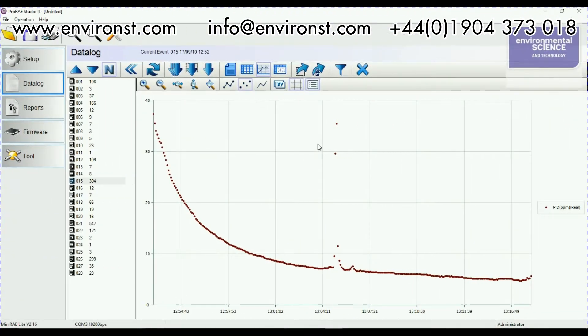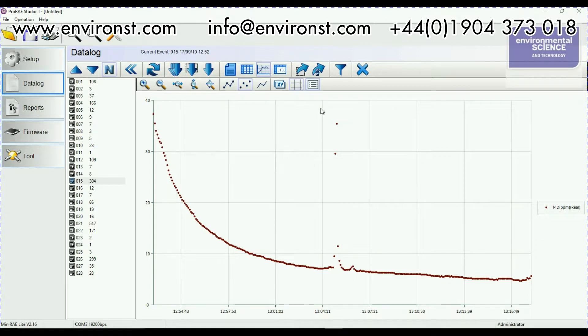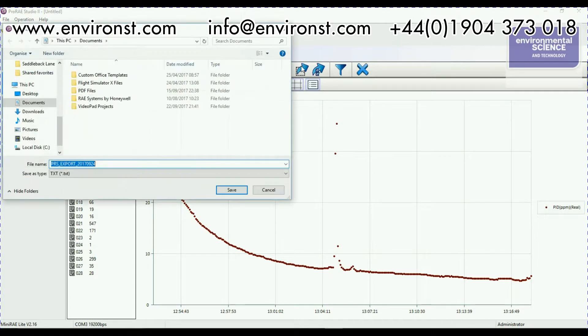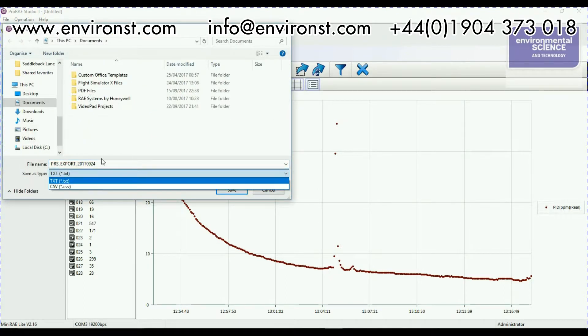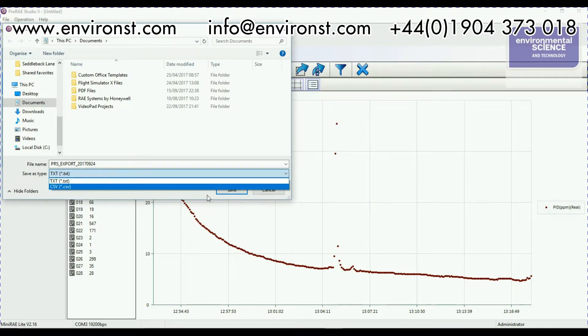The other thing that we can do here is if we want to export our data we've got these two options here which are basically the two export options. I can click on this one and I can export it as a CSV or a text format. That's when we're getting the data log out fairly easily.